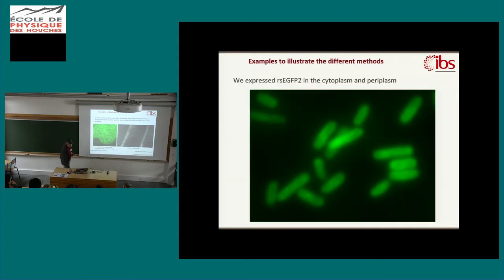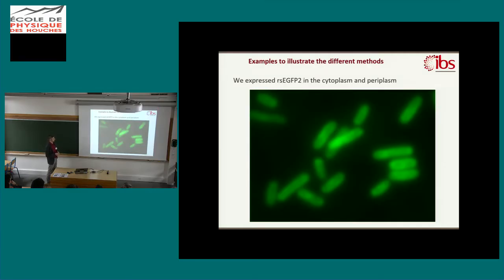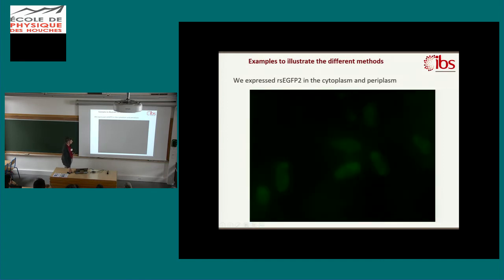So that's what we did. First, we tried to express it in the cytoplasm, and then in the periplasm. In the cytoplasm, it worked like that, so perfect. Then we engineered the protein: we fused it to a secretion sequence to the periplasm, and we imaged again, and we got that. That's a real image, it's not a bug. By pushing the brightness to its limit, we get that. So we see the proteins indeed, but we admitted that it was a kind of failure.